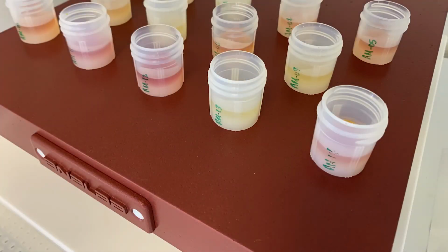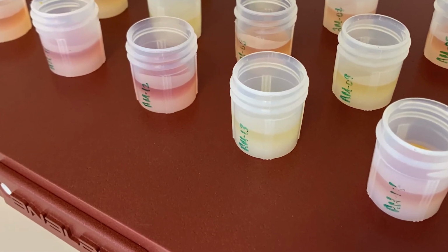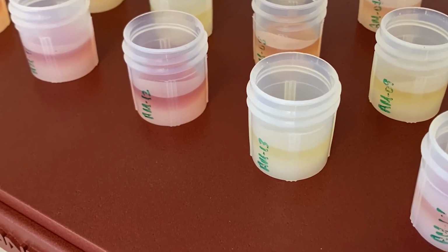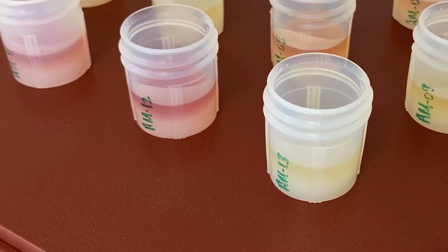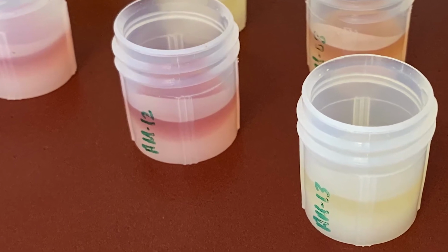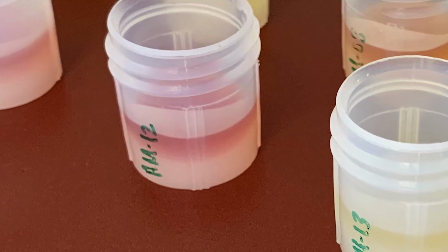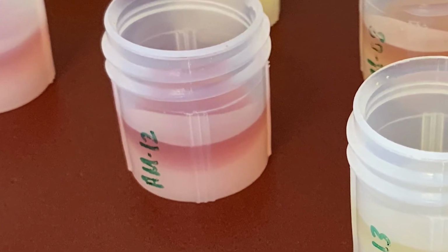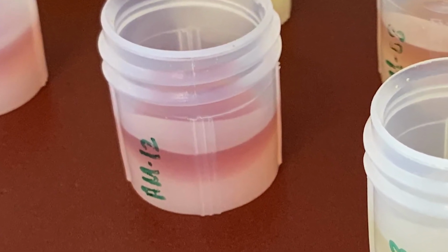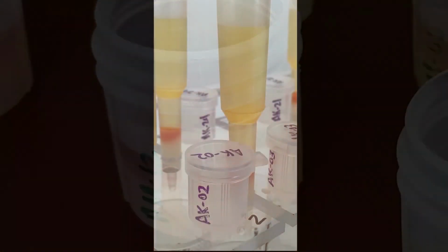Once the samples have the acid added to them, they then go on a special hot plate. This hot plate's actually made out of a Teflon coated block of graphite, the same thing that's in your lead pencils, which is pretty wild. The graphite allows for things to heat up at a really consistent temperature, and so by adding heat to these samples, it helps us to break these down. Again, we're going from incredibly hard, solid materials, things like rocks and sometimes plants, into a pure liquid, which is really, really amazing.